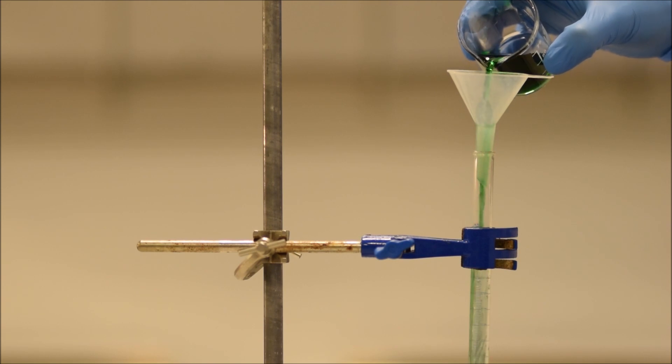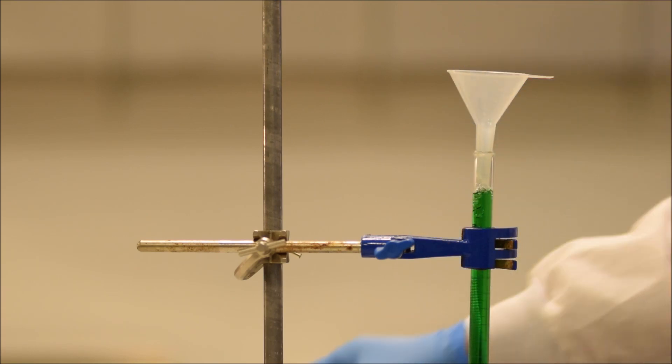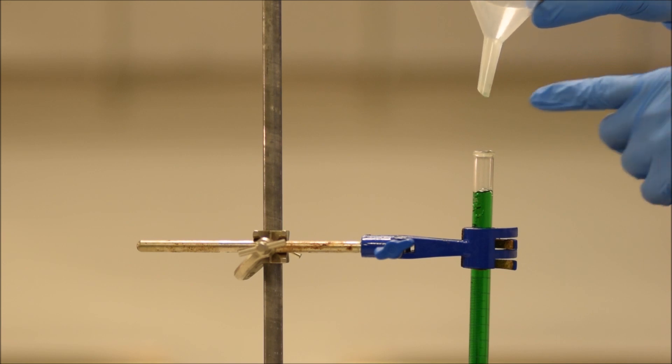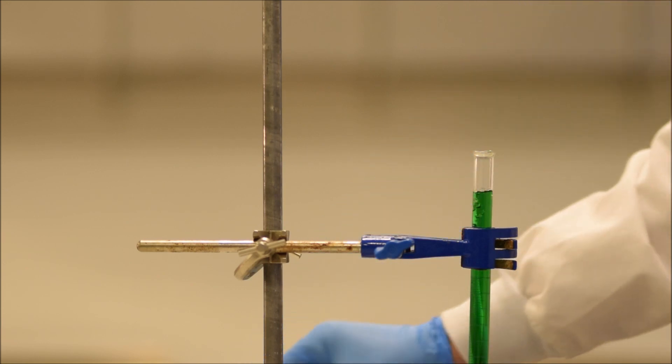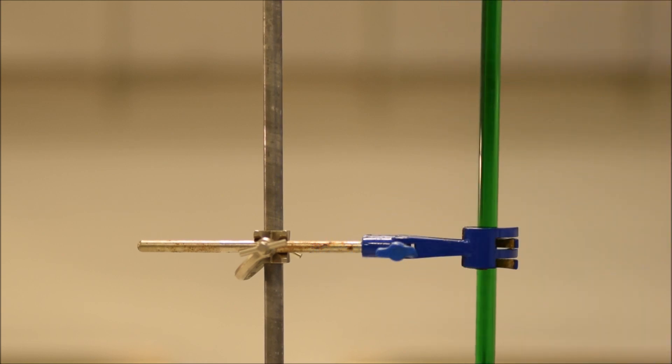Pour it in until you have it full, past the mark of zero, so nearly all the way up to the top, and you'll see why in a second, and then take the funnel out. And you've got to remember to take the funnel out, because if you don't and you're measuring precise volumes, that little drop can fall down and change your result. And that can be a bit of a disaster, because then you've just got to start your measurement all over again.